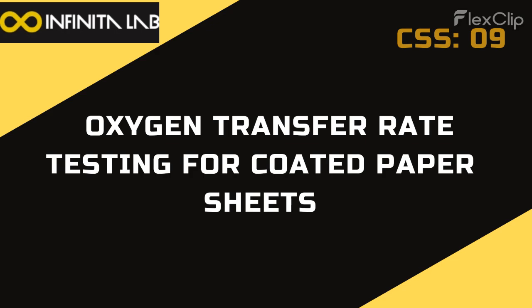So when we're talking about oxygen transfer rates, we're really talking about how easily oxygen can get through a material. And you can't see oxygen, obviously, but it's doing stuff all the time. Think about it, food going stale, priceless artwork falling apart over time. Like oxidizing and stuff. Yeah, that's oxygen at work. So basically knowing a material's OTR is like having the secret knowledge of will this thing protect the stuff inside it from oxygen? Yeah, exactly. That's a great way to put it.